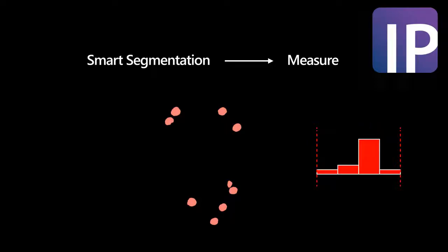ImagePro provides an interactive object distribution histogram that allows the user to select a range or series of parameter ranges that can be set manually by the user or automatically by ImagePro. In either method, the ranges set can be used to filter the population of objects based on the measurement requirements.